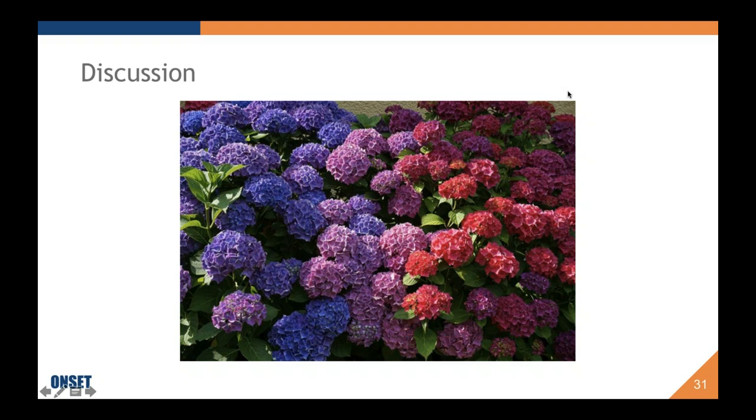Average lifetime of the probe electrode, we did cover that in pretty good detail, Andre. Probably best practice is around 6 months, but the actual lifetime will depend on the maintenance of the electrode, the exposure to environmental factors, and any fouling. It will not actually expire after 6 months. We just recommend that you check it relatively frequently, depending on the application. We talked about the allowable temperature range in detail, but feel free to contact us again, Steve, if you missed that slide.